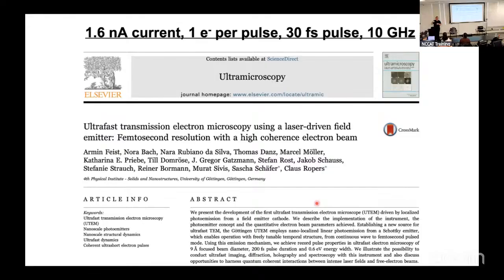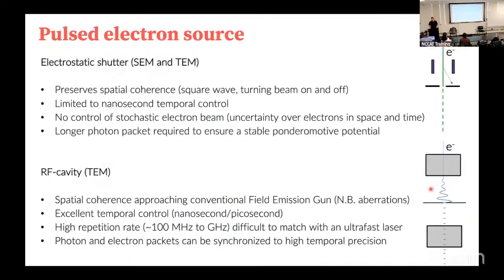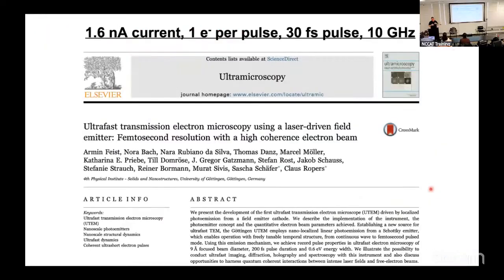And so as the laser comes in and the laser hits the electron packet, some of the ones at the top and the bottom, because they're all Gaussian. The photon packet coming in looks like a Gaussian, and the electron packet coming down looks like a Gaussian. It's why we draw them as Gaussian. So you can see here these little Gaussian packets. And so the ones at the very tail don't get hit because they're just stretched. It's stretched too far. But we hit them enough that we saw a real effect.